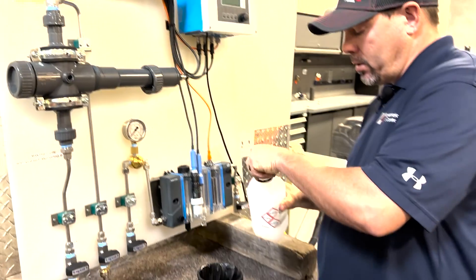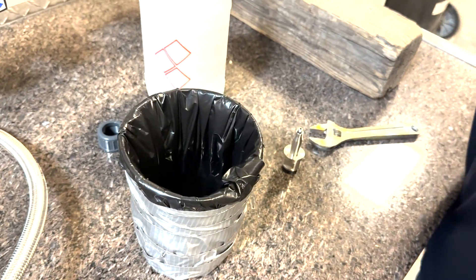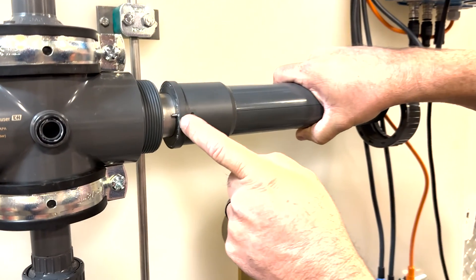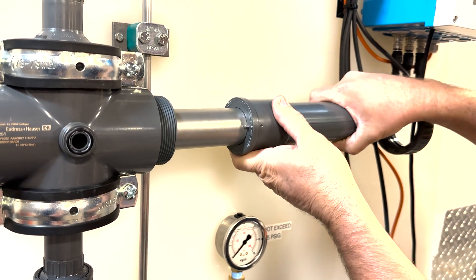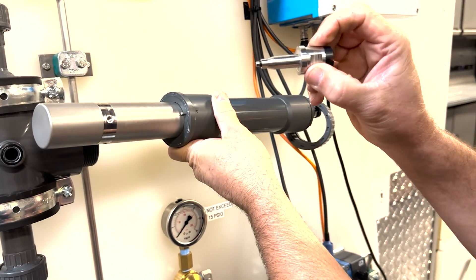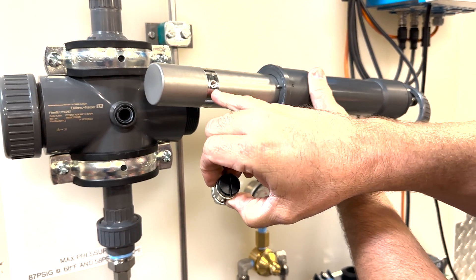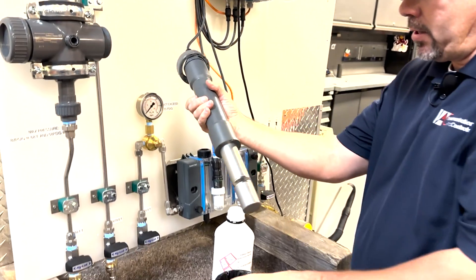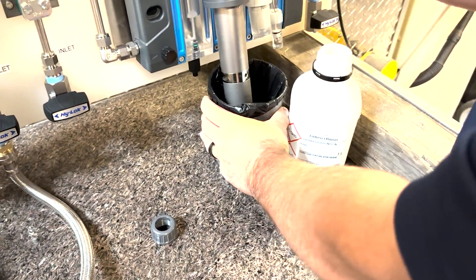We'll go ahead and put some of our solution in the container — just enough so you can completely immerse the sensor. The sensor slides out. There is also a spot for the attachment that allows air to go in. When putting this back in, you should see that hole line up in the center and see light coming through. Make sure it's lined up so it threads in correctly. Once you've got the sensor out, immerse it in your solution once you start the calibration process.